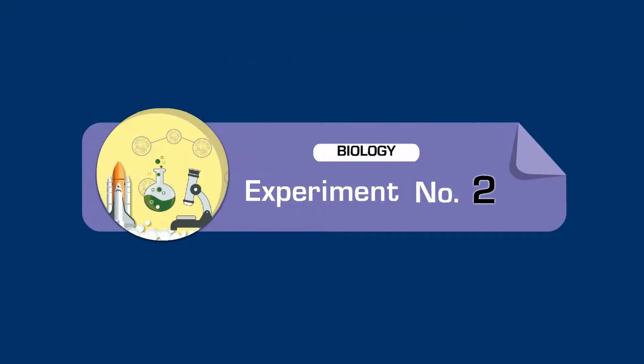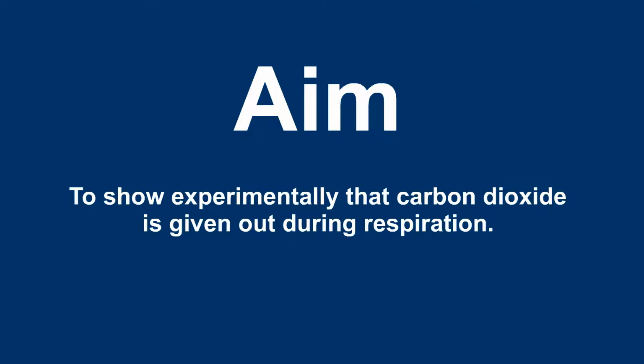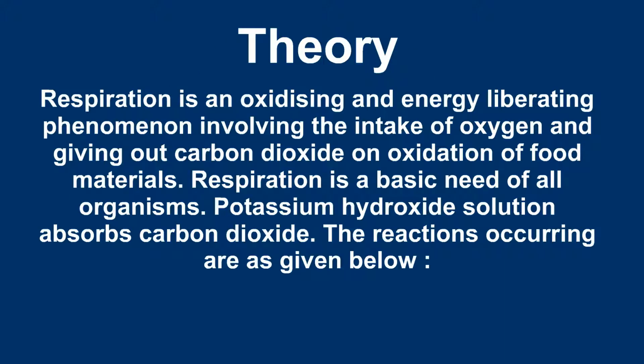Experiment number 2. Aim: to show experimentally that carbon dioxide is given out during respiration. Theory: respiration is an oxidizing and energy-liberating phenomenon involving the intake of oxygen and giving out carbon dioxide on oxidation of food materials. Respiration is a basic need of all organisms.